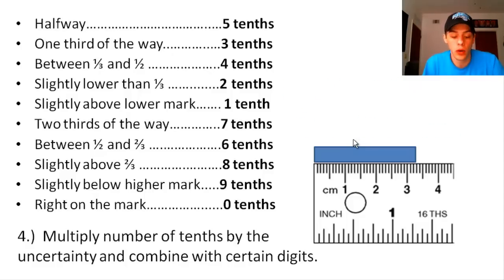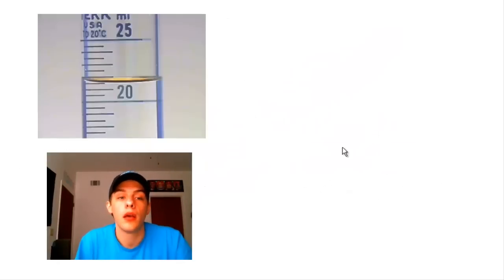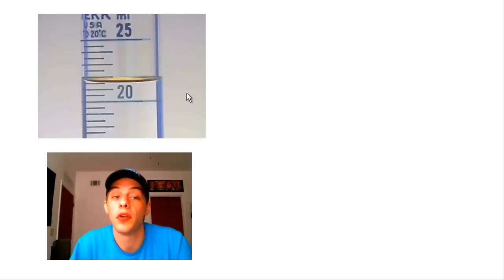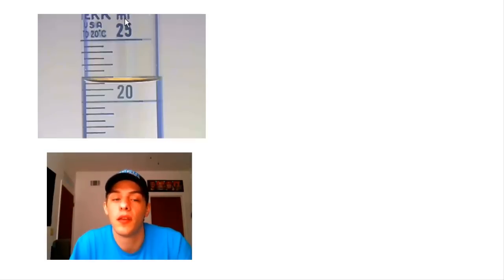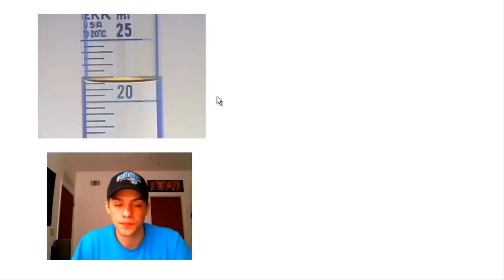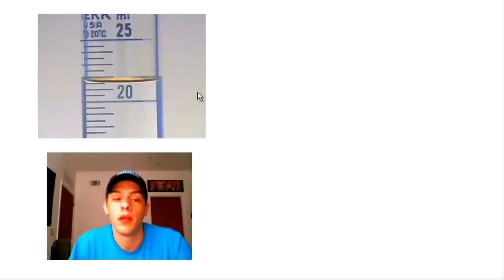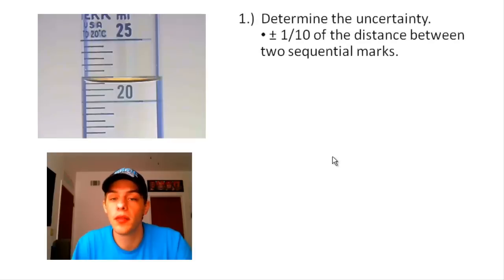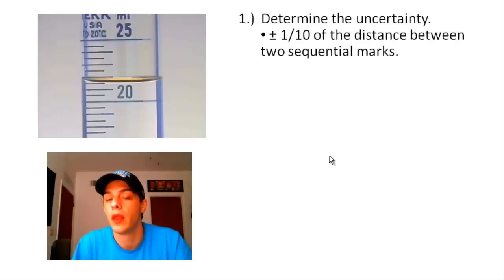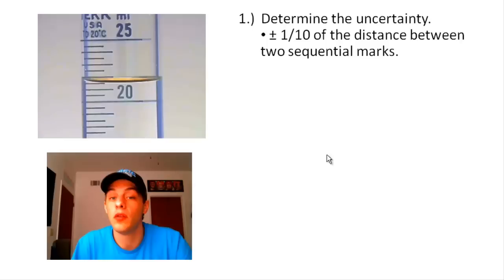Let's do one more example. This time we're not looking at a length but a volume. This is a graduated cylinder measuring milliliters. We're trying to determine the volume of the liquid in milliliters. Again, the first step is to determine the scale's uncertainty — we do that by taking one-tenth of the distance between two of the smallest marks.